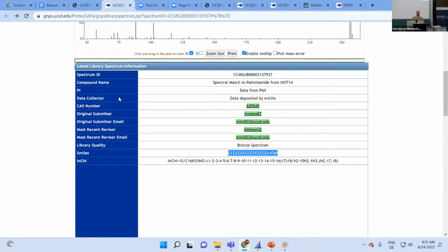So if you find an exciting molecule and it's, I don't know, huge, before you start drawing it in ChemDraw by yourself, try to get the SMILES code from here, or go to PubChem or so, where the SMILES code is displayed. So that's often pretty useful.